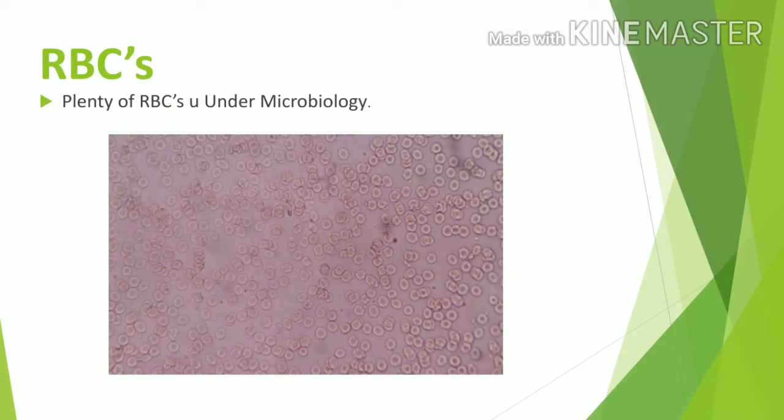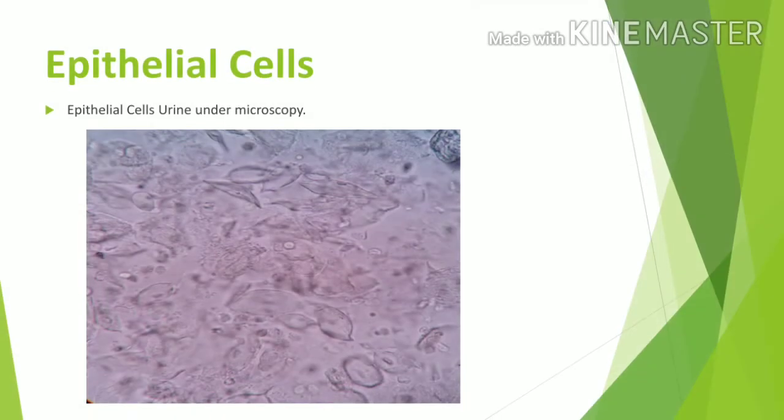Then the next picture — plenty of RBC seen under the urine sediment. Moderate number of epithelial cells seen under the urine sediment in high power field.